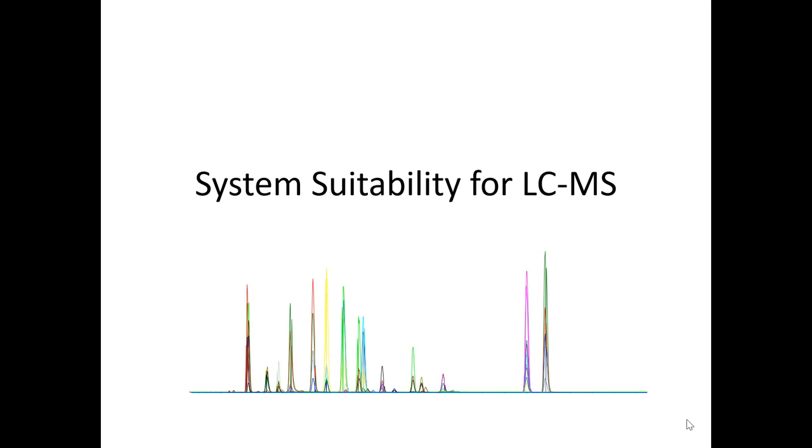having a system suitability. So when I was in graduate school, and I went to grad school specifically to learn how to do mass spectrometry, I worked on a very old FTICR system that took a lot of time and effort to get the ions from where they were being generated at the ion source to the trap, or the heart of the FTICR, and there were not focusing quads or anything, there were just lenses that you had to tune with voltages, and you would either see a signal or you wouldn't in the beginning.